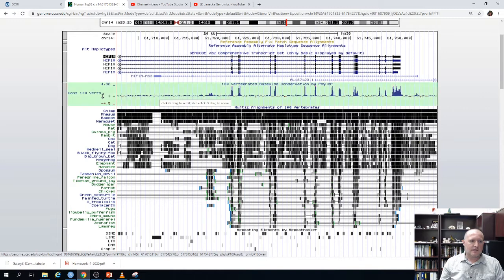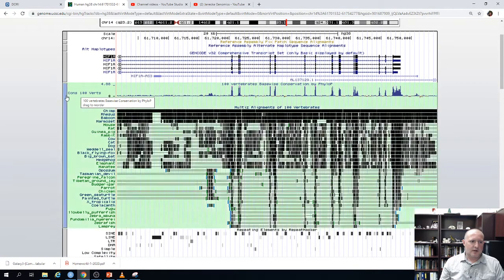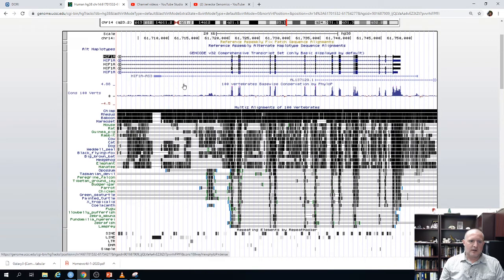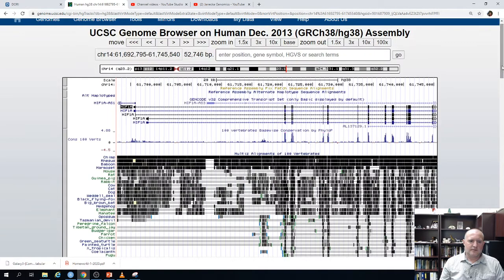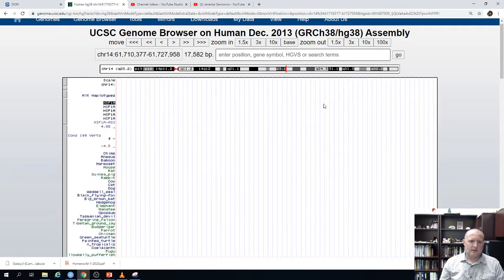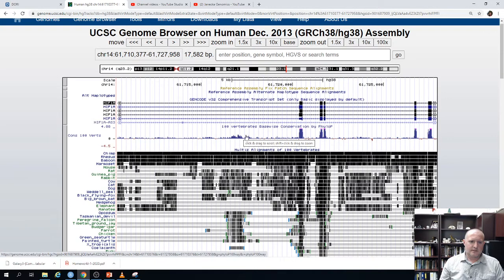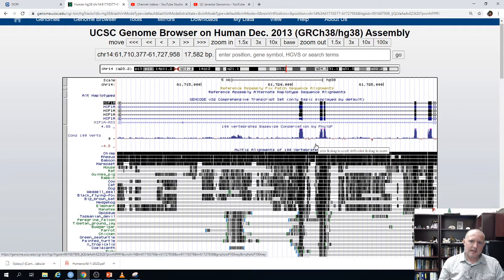If we look at some of the introns, even within certain introns there are sections that are quite conserved — not as conserved as the exons, but there are notable peaks. Let me zoom in a little bit. Notice there's a section right here in this intron that is more conserved than the rest of the intron. Introns are normally free to vary, so this actually suggests there's a functional sequence within that part of the intron.